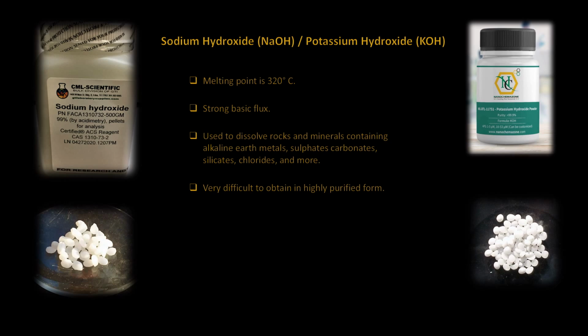Some manufacturers or suppliers will charge up to $250 or more for 500 grams of product. Product that is less than 99% pure may not be suitable for trace element analysis. Now, these two chemicals will attack your crucibles. Silver crucibles are the most resistant to attack.